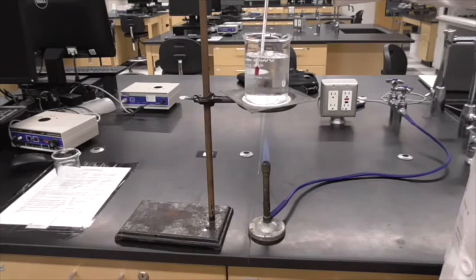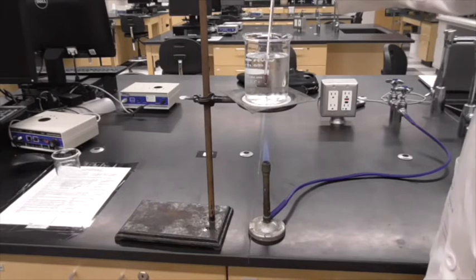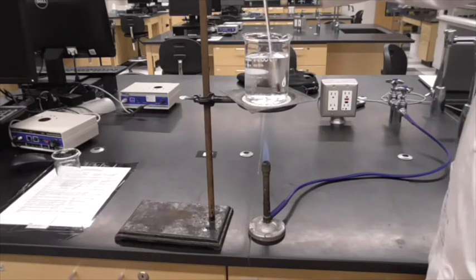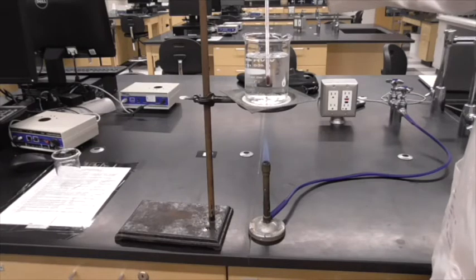Remember, when you're taking the temperature of the water, you want it somewhere in the middle of the water. If you're on the bottom, it's a lot hotter, because that's where the heat from the Bunsen burner is coming from. If you're on the top, it's a lot cooler. So somewhere in the middle gives you a good measure of the temperature. And we're looking right now at about 29 degrees.